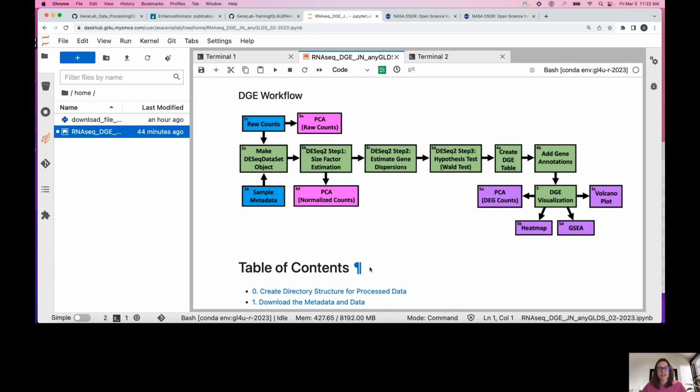Whereas before, if you remember, we went through a series of steps where we added in annotations from Bioconductor for that specific organism, and then we used those IDs to add in STRING IDs, so information about the protein analysis, and then we added in information about gene ontologies. We went through all these iterations where we were building it up.